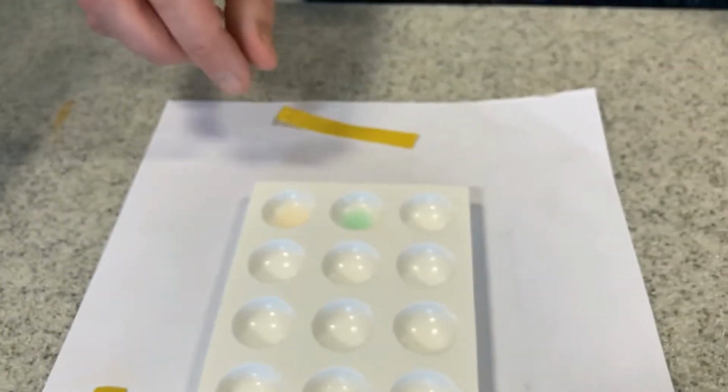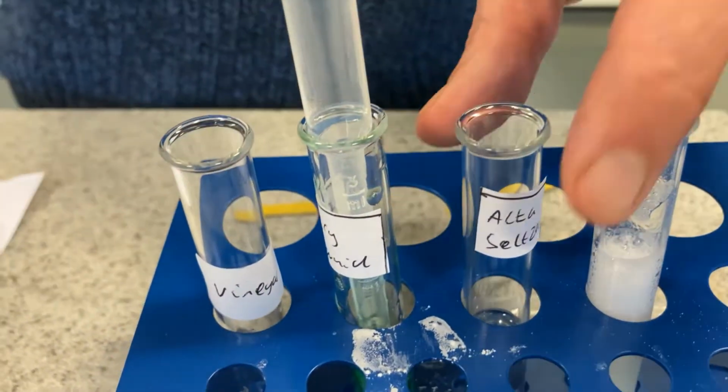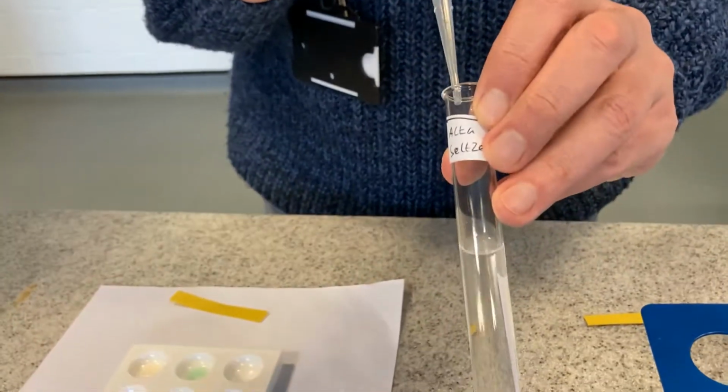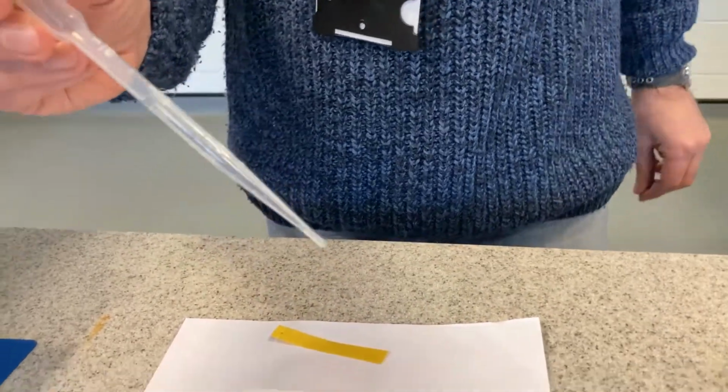Right, I think we'll go for the next one. Oh no, that's the wrong pipette. Got the right pipette now. Thank you. This is Alka Seltzer. As I said before, it's stomach pills. This is what can cure an upset tummy.